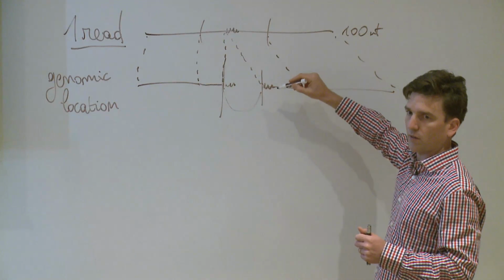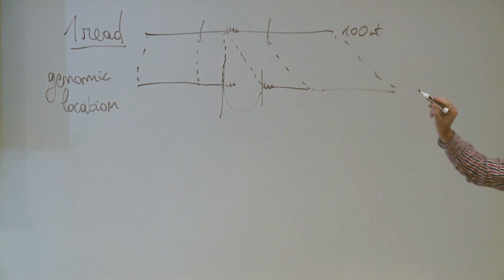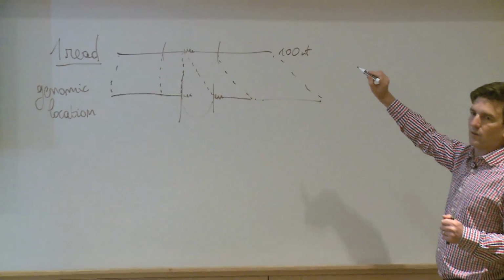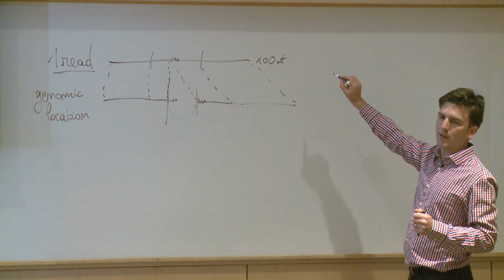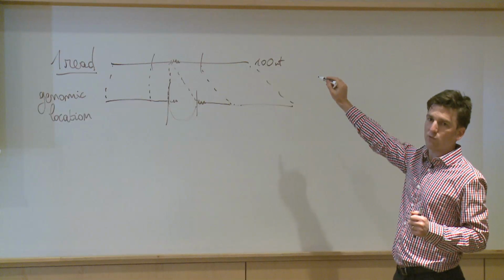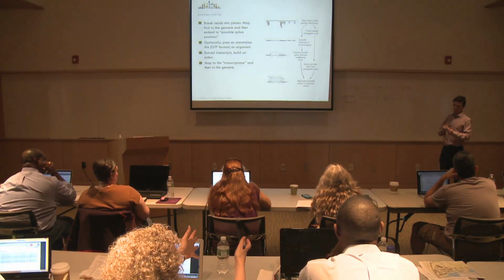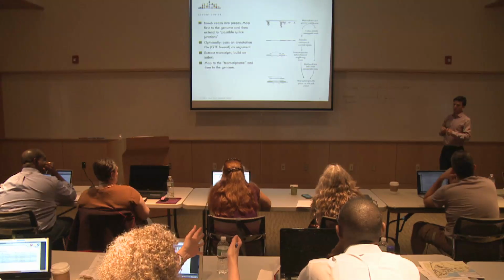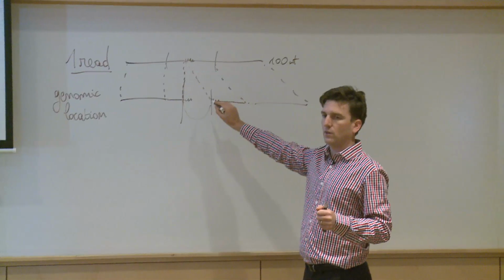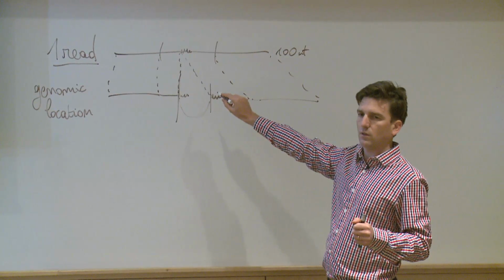What if you've got lots of splice segments? For some of these things you can have 200 different ones. PacBio reads are multiple kilobases, right? So they can have multiple splices. What I'm saying is that there may be a lot of splice variants that we don't know. Well, in the strategy that you described, you don't know the splice variant. You don't know the splice junction. But you're showing that only one of those three is in the middle of a splice.